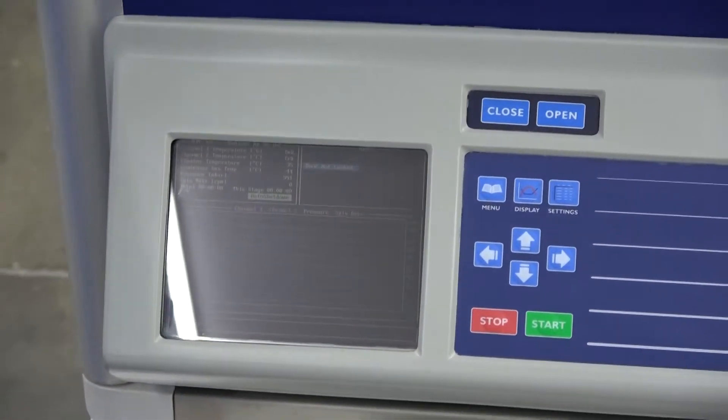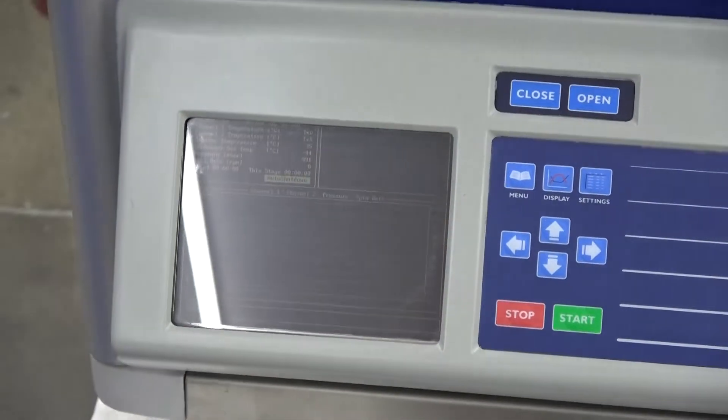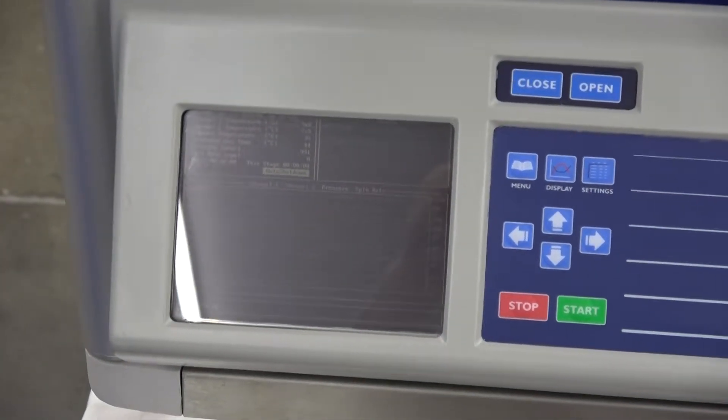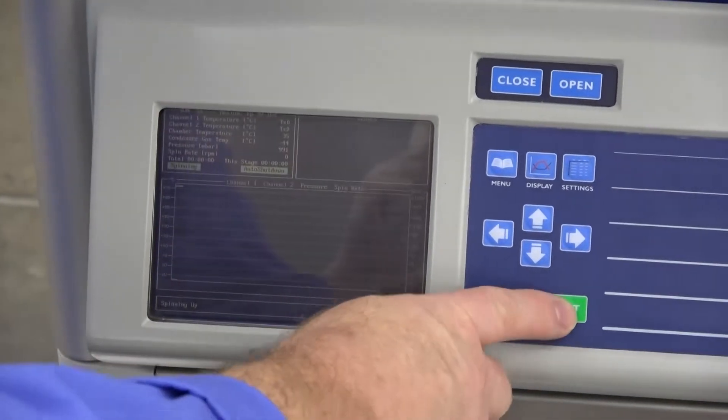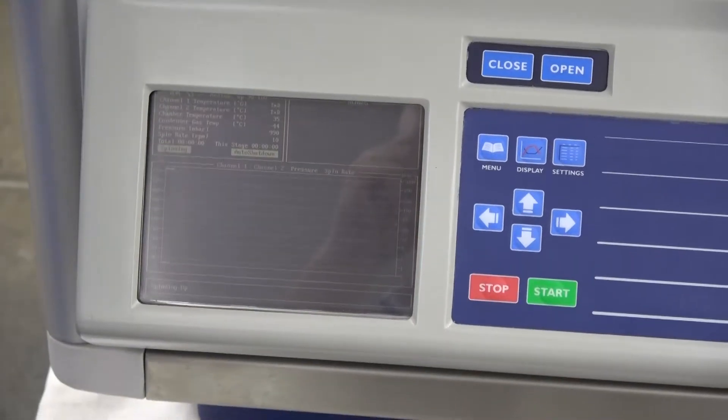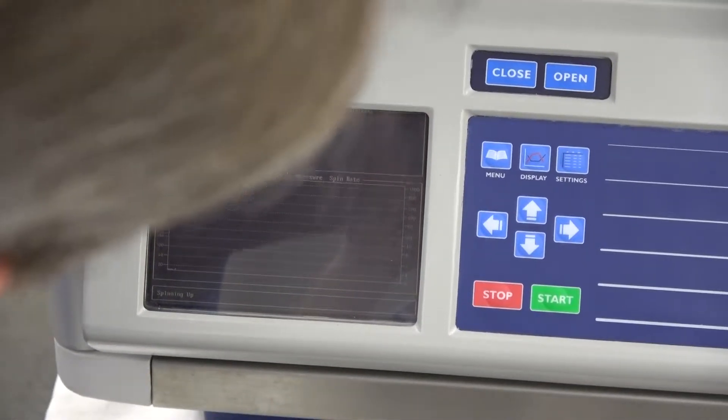All right. Secure. Now, I've already set the program, and all I've got to do is pretty much hit start. It's going to go ahead and start pulling the pressure down.